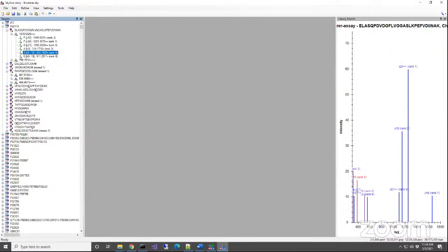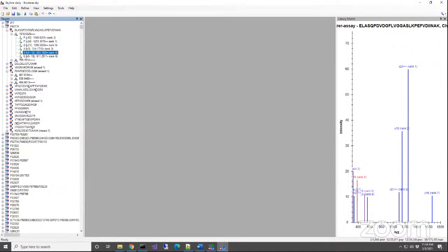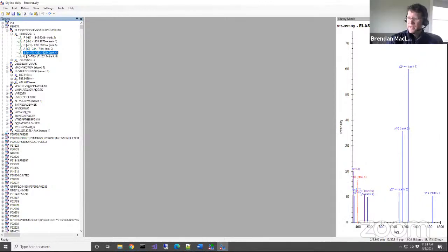I could give you a little bit of feedback on the one that was addressed to me because I'm not sure how to answer it. Sure, go ahead. So it says one would right click on the transition you want to remove and untick the quantitative checkbox, so does that solve your concern?